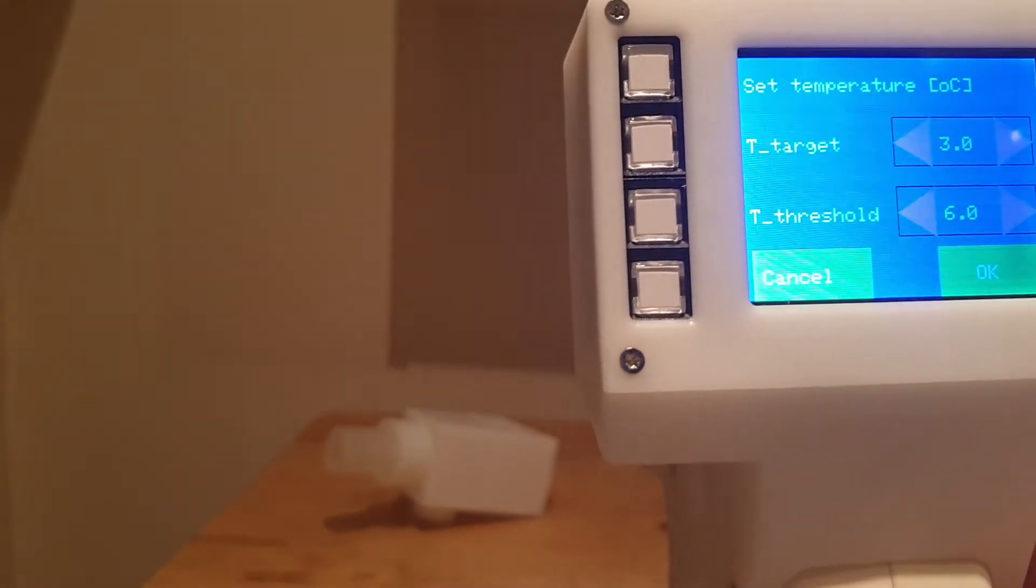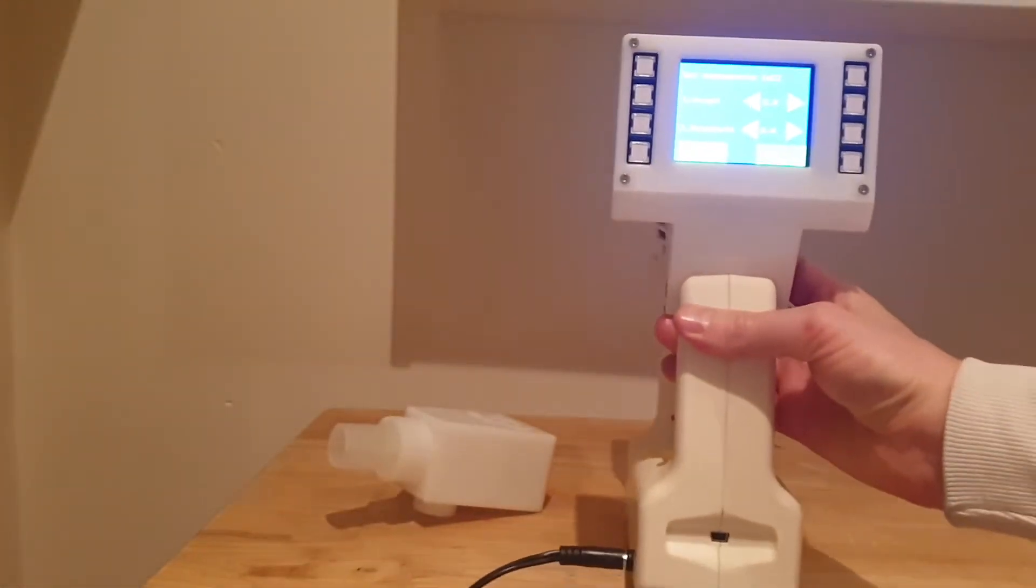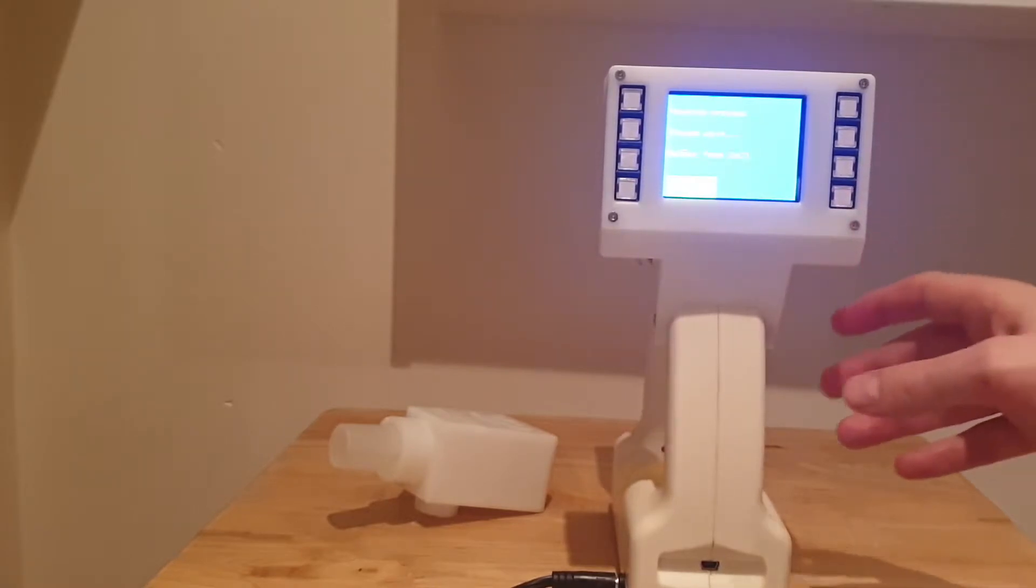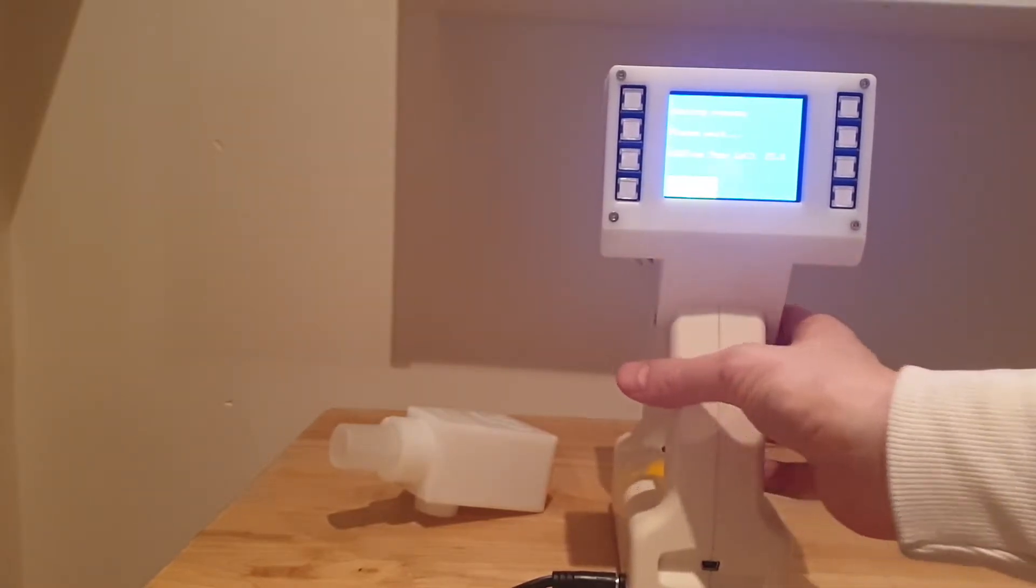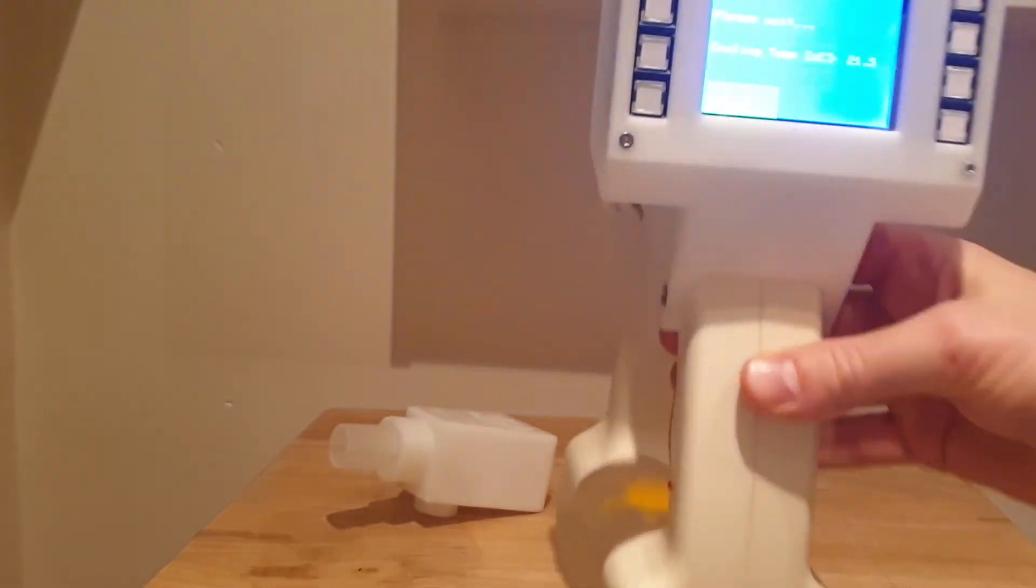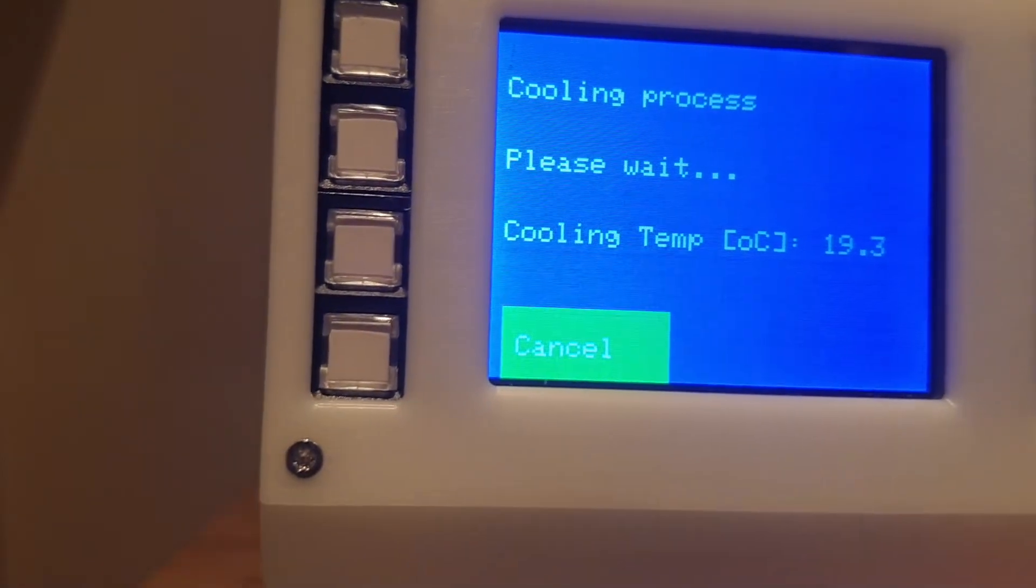So what I'll do is, we effectively have a, if I just spin this round, effectively a Peltier here and we can control the Peltier and condense the atmosphere. So I'm just going to set some parameters on that Peltier, which I've done. And now it's basically cooling it down. So if I just bring this close, it's saying it's at 20 degrees, 19. So it's basically cooling down at the moment.